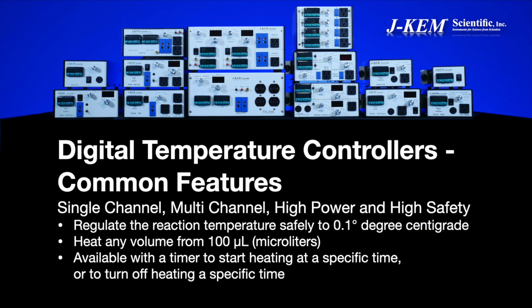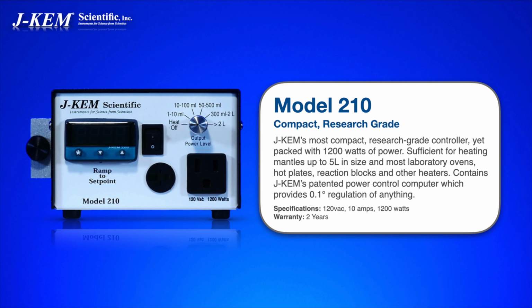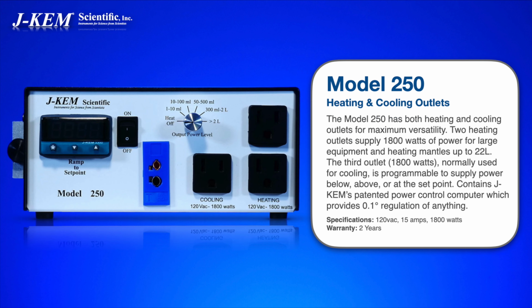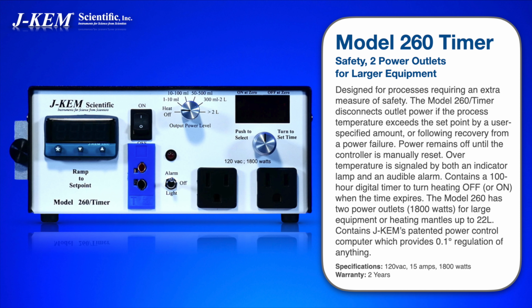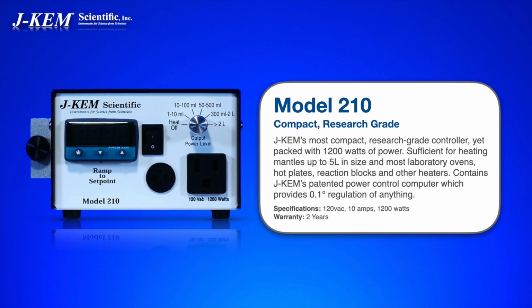When you look at our catalog and you can see 8 or 9 different models of temperature controllers, how do I choose? The 210 series we say is for reactions 5 liters or less. Then you get into the larger ones, the 250s, the 260s, the 270s, and therefore reactions up to 22 liters. You can look at the safety controllers, the 270. Can I use a more standard 210 controller that doesn't have sophisticated features of a 270?